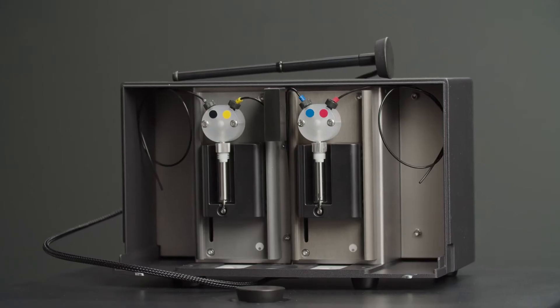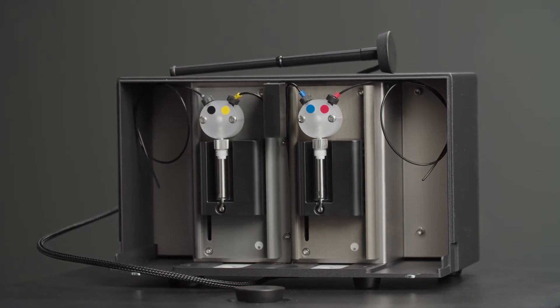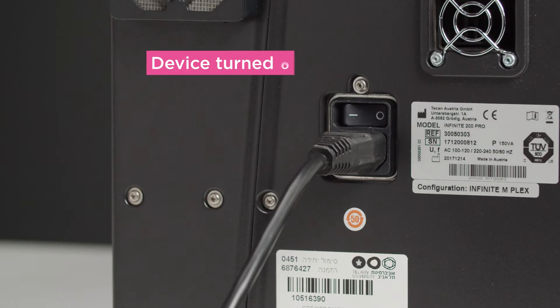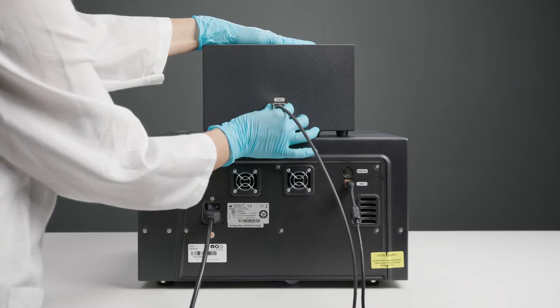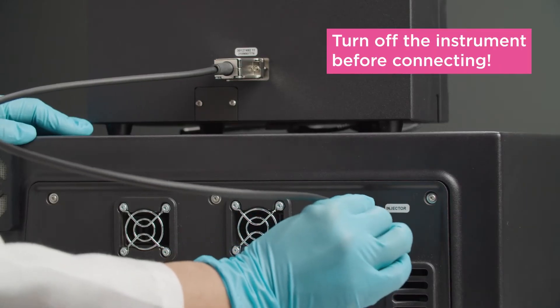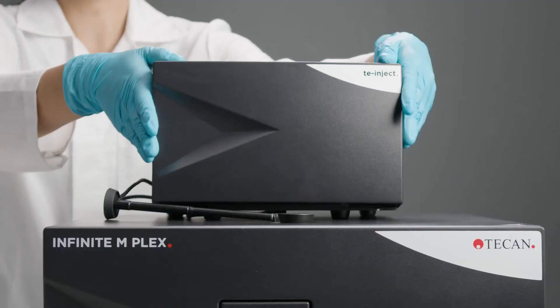The injector module consists of one or two syringes. Before connecting the injector module, make sure your instrument is switched off. Put the module onto your device and connect it with the cable provided. Never connect or disconnect the module while the instrument is turned on.